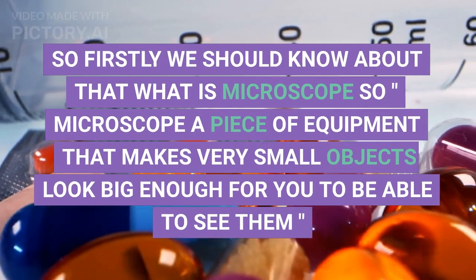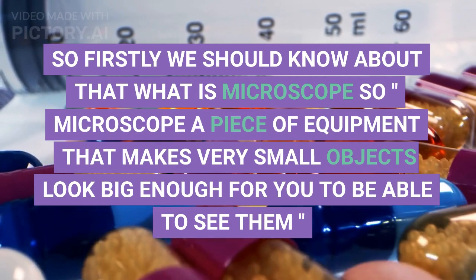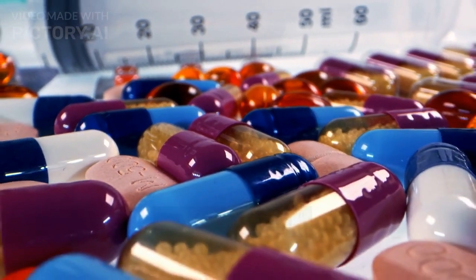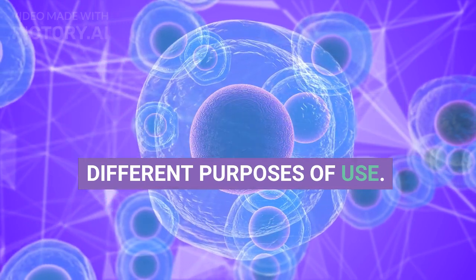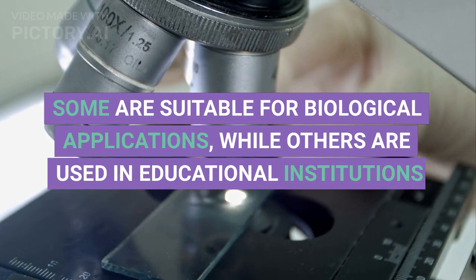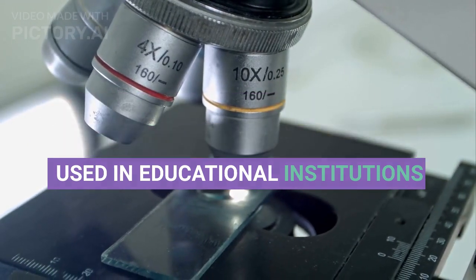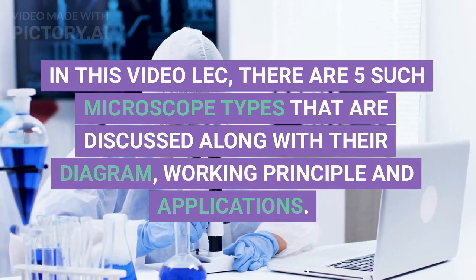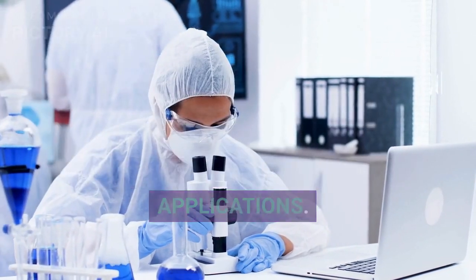So firstly we should know what a microscope is. A microscope is a piece of equipment that makes very small objects look big enough for you to be able to see them. There are different types of microscopes and each of these has different purposes of use. Some are suitable for biological applications, while others are used in educational institutions. In this video there are 5 such microscope types that are discussed along with their diagram, working principle and applications.